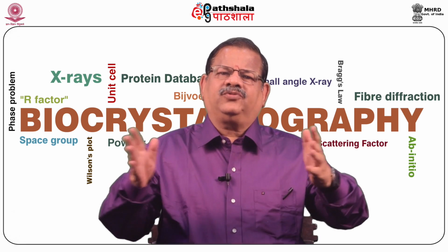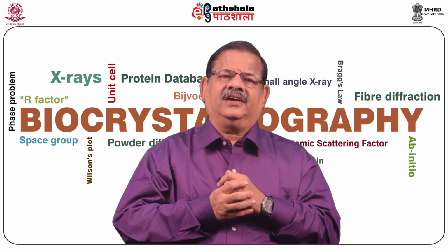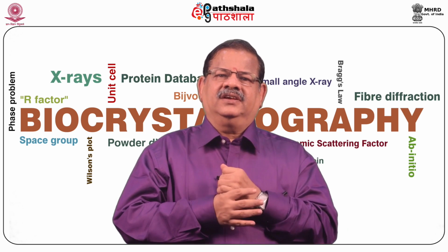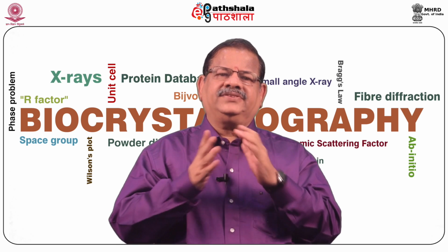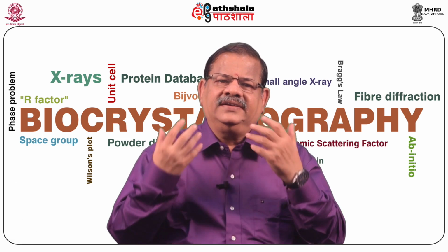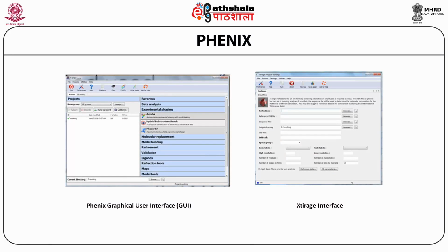Phenix has a range of tools for the analysis, validation, and manipulation of X-ray diffraction data. phenix.xtriage is a comprehensive tool for analyzing X-ray diffraction data. This carries out tests starting from space group determination and detection of twinning to detection of anomalous signal. We have seen what one uses the Phenix program for. Again, this is a recent version of Phenix. It's user-friendly. They have developed the graphical user interface called GUI for executing Phenix. That is shown in this slide.